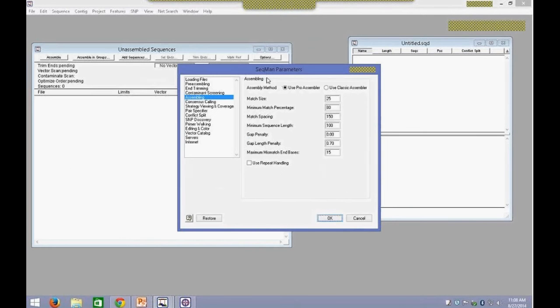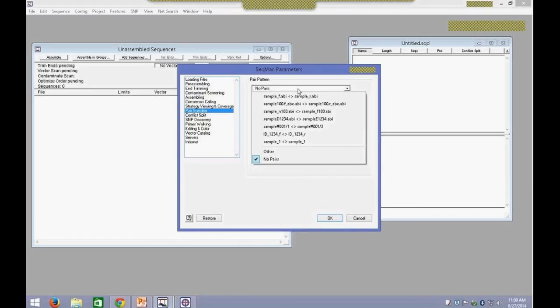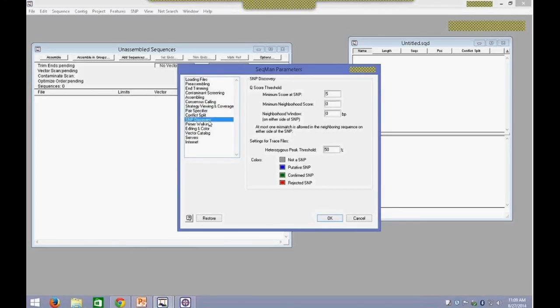If you're not sure about what value to enter, you can always contact us directly and we can guide you on the parameter settings. Similarly, you can keep going down the list and look at pair specifiers — if you have paired-end or dual-end reads, you can choose a pattern from this list. By default it's turned off. Then we can also go into SNP Discovery and you can change your heterozygous peak threshold. By default it's set at 50%, so if the secondary peak is 50% of the original peak, it will be called a heterozygous base. And then we have additional advanced options for primer walking and coloring as well.